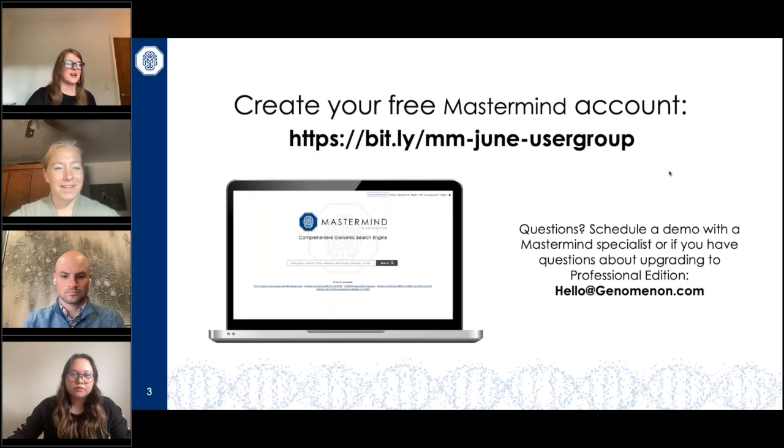Great. Someone had just asked what other automation potential exists in the API, so I'm glad we covered that. Good timing. Just to expand on that, there's a lot of other potential there, so please engage with us on that one. We do all kinds of work through our API: gene disease relationships, adding phenotypes to VCFs. There are a lot of things that we aren't covering. But the general answer is if it's doable in the user interface, it's doable in a high throughput manner in the API. Another question is, do you have performance characteristics for the API variant annotation function?